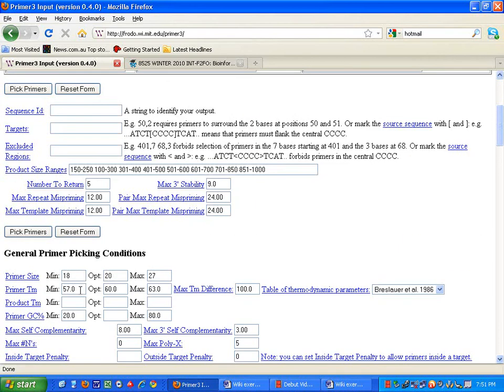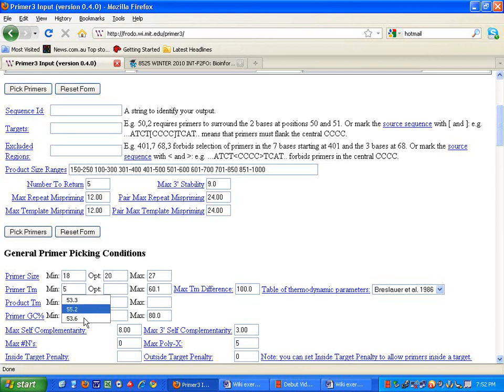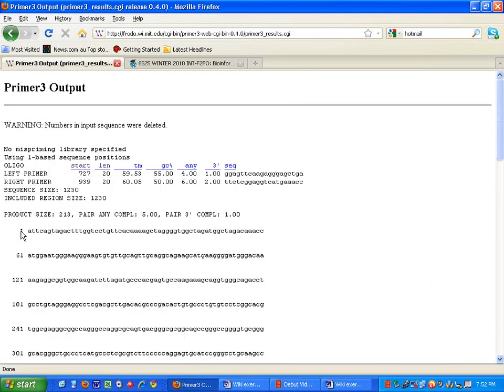As with the GC content, we need to be very careful in what we place to the optimum. We're not looking for an optimum. We're looking for a GC code. So, 60.1 at the maximum. We're looking for a range. 53.6. Here we go. 53.6. We're not looking to drive it in. We're just looking for a range. Let's see. Most likely, I wouldn't be surprised if it generates... Here we go. Look.